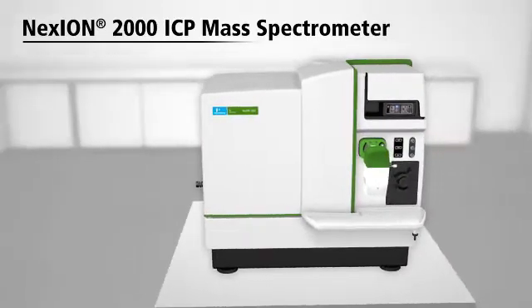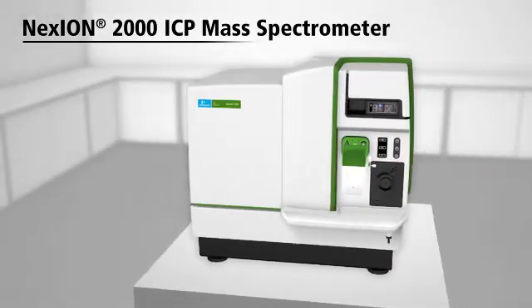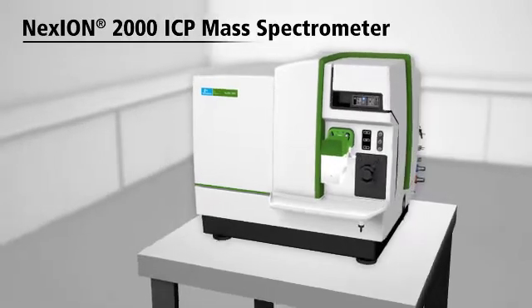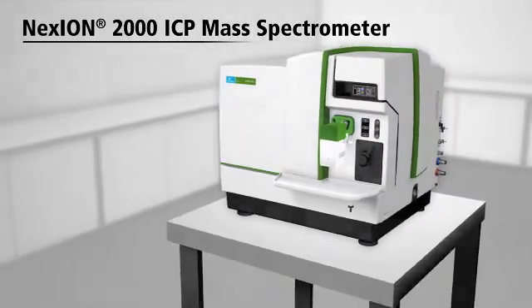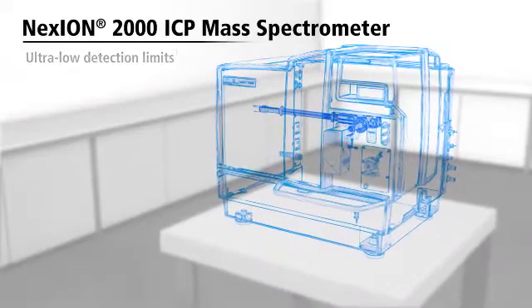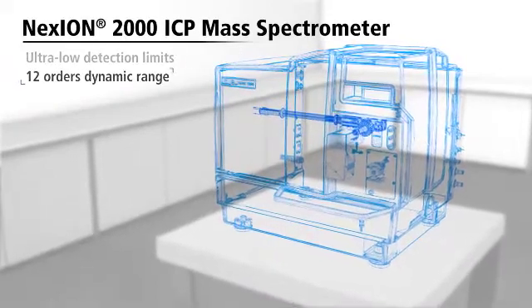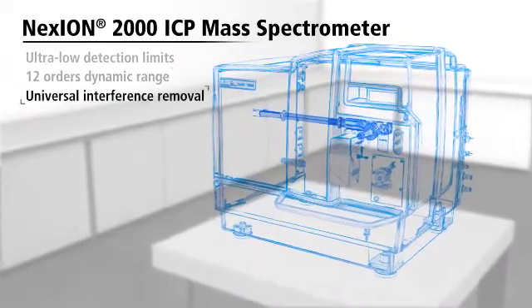Perkin Elmer's Nexion 2000 is a compact system that combines the power of a triple-quad with the ease of use of a single-quad instrument. Engineered to deliver ultra-low detection limits, 12 orders of dynamic range, and universal interference removal.